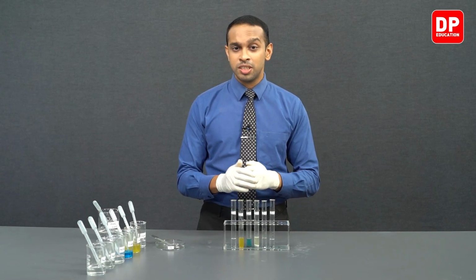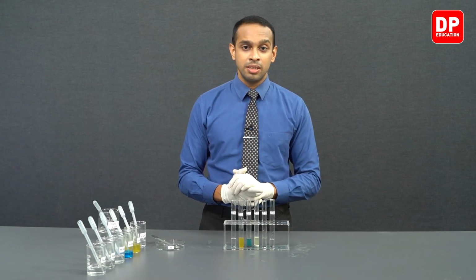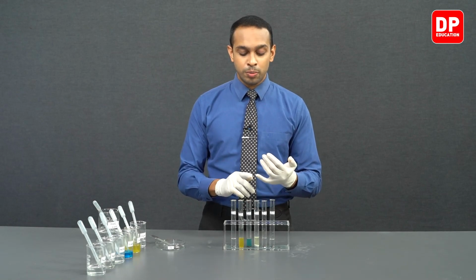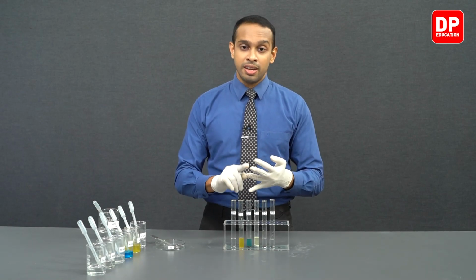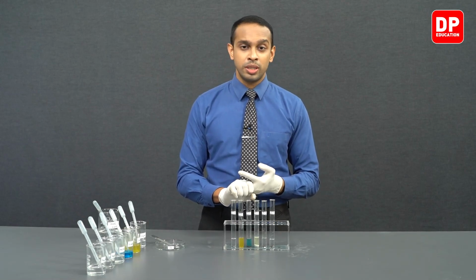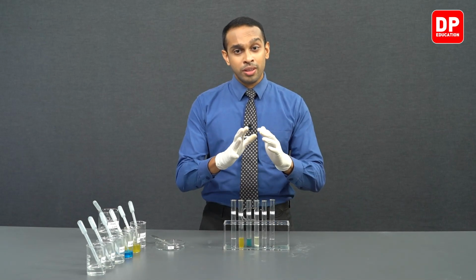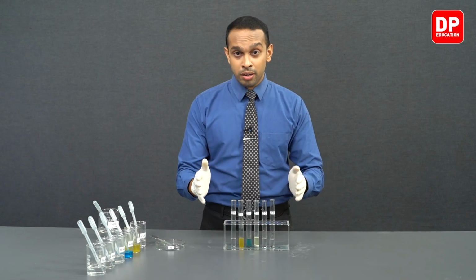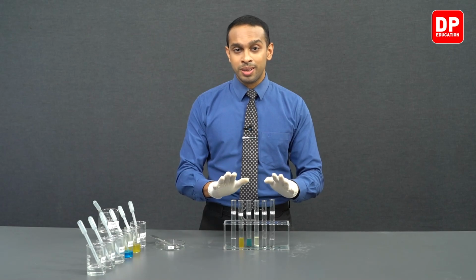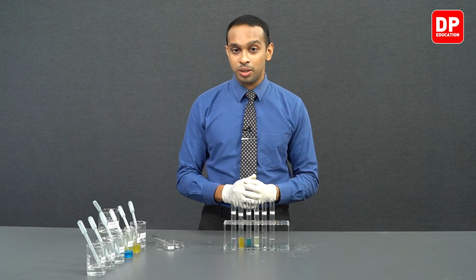Then we observed zinc. Zinc was able to displace 3 metals. So out of the entire set of metals over here, zinc was able to displace iron, lead, and copper. So zinc would be the third most reactive metal we have here in the lab today. I'm not talking about the entire reactivity series. Out of the metals and out of the iron solutions we have over here, out of the elements we were testing with, zinc is the third most reactive out of the 6 elements we tested today.